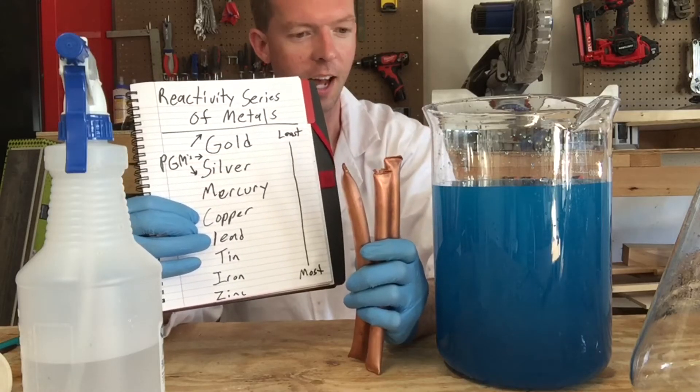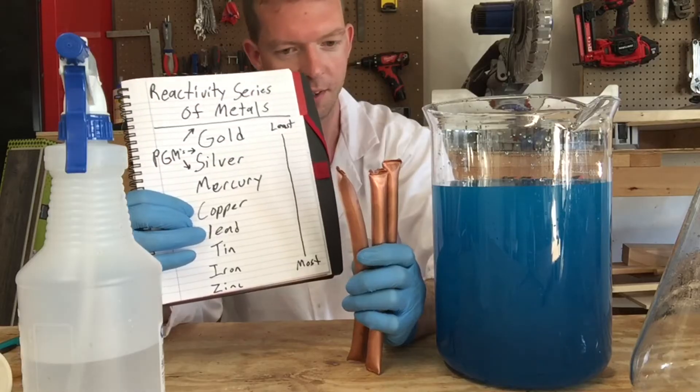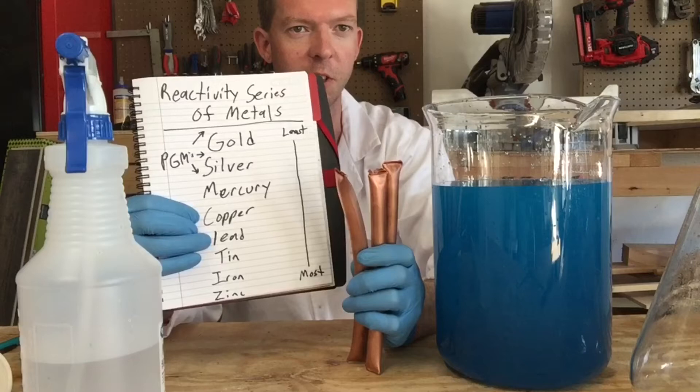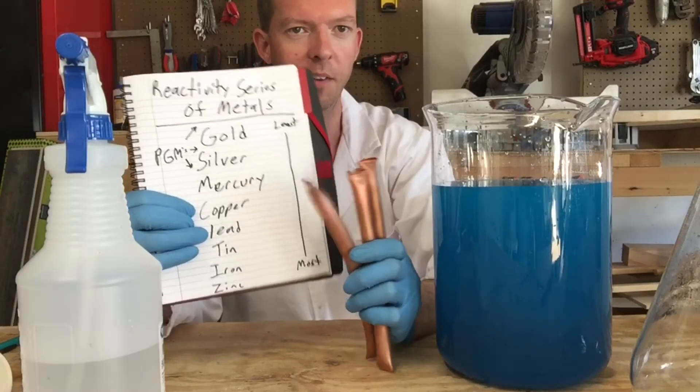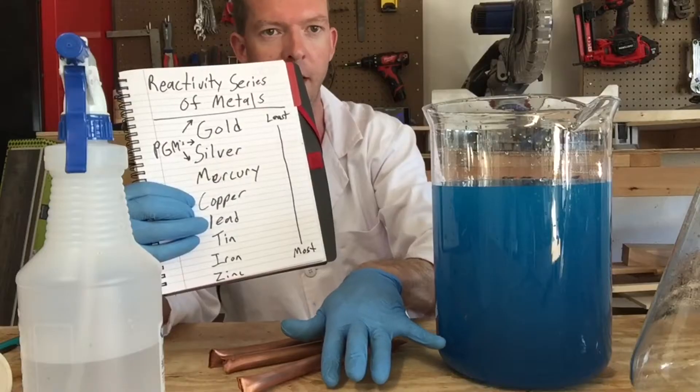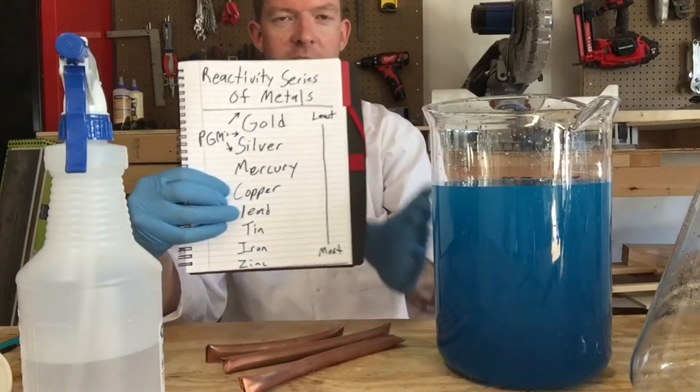What we're going to do is take some pieces of copper, stick them in the jar, and what's going to happen is the silver is going to crystallize onto the copper as the copper itself goes into solution. Essentially the metals are going to trade places. I'll show you that throughout the process. I'm probably going to leave it in there a couple of days to make sure we get all of our silver cemented out. When we're done the silver will end up looking like cement at the bottom.